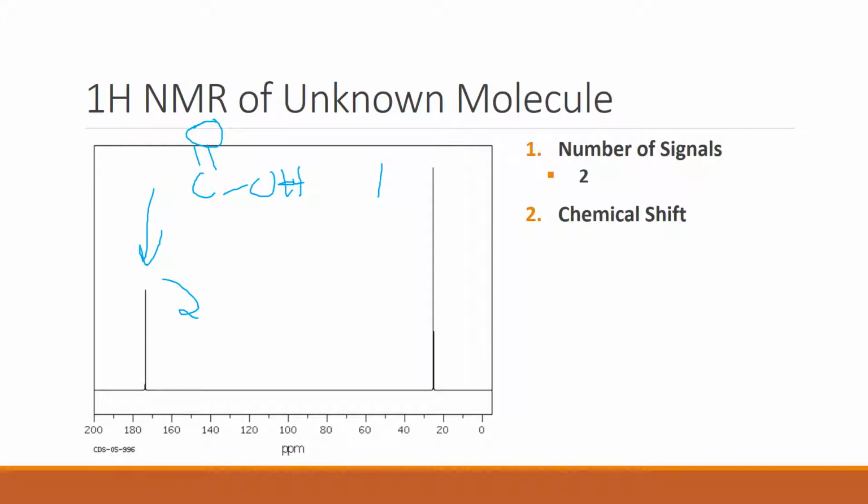Okay, and this one points to either an sp3, an sp2, or just an sp, or it could be an alkyl halide, so C to an X. Now, this is telling because an alkyl halide was present in both, or reasonable based on the amount of chemical shift, in both our carbon NMR and our hydrogen NMR.